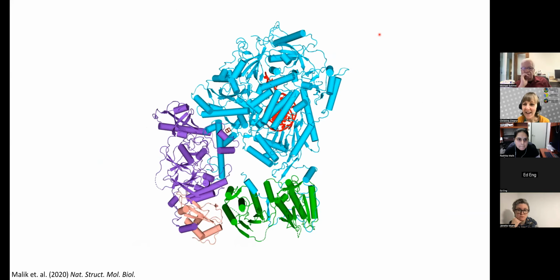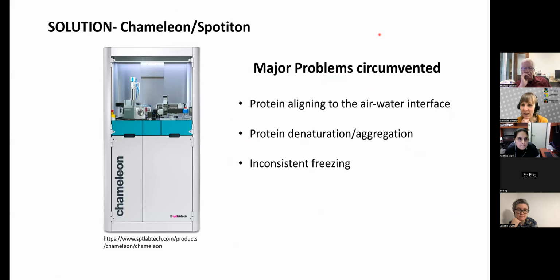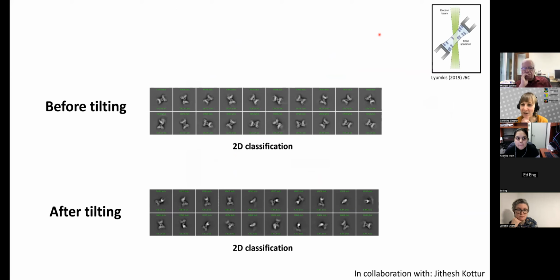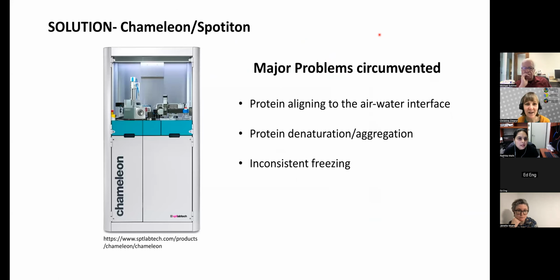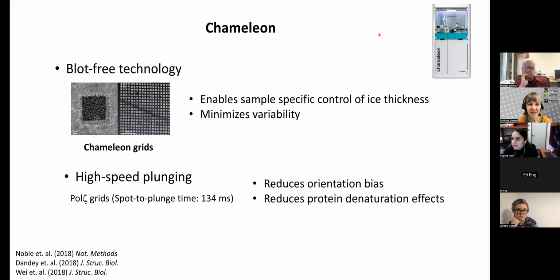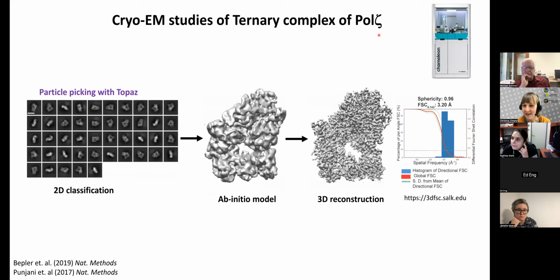And then there's a question about which neural network software you use for the images. I'm guessing that might be a question about your Topaz picking. If I'm mistaken, whoever asked that question, you can post a follow-up. Yeah, it was Topaz. We use Topaz for the picking.